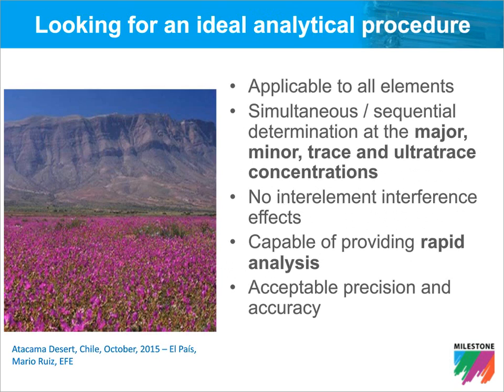Thinking about an ideal analytical procedure, certainly microwave-assisted sample preparation is helping ICP OES and ICP-MS to perform accurate trace analysis. Of course, only by using a clean sample preparation procedure will we be able to exploit the analytical capability of ICP OES and ICP-MS.